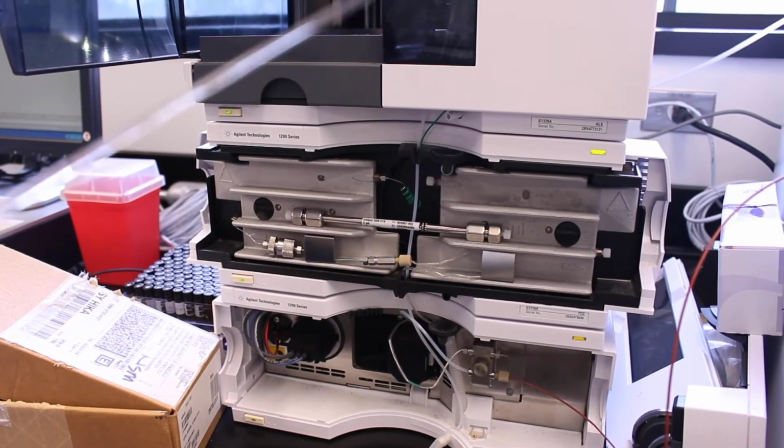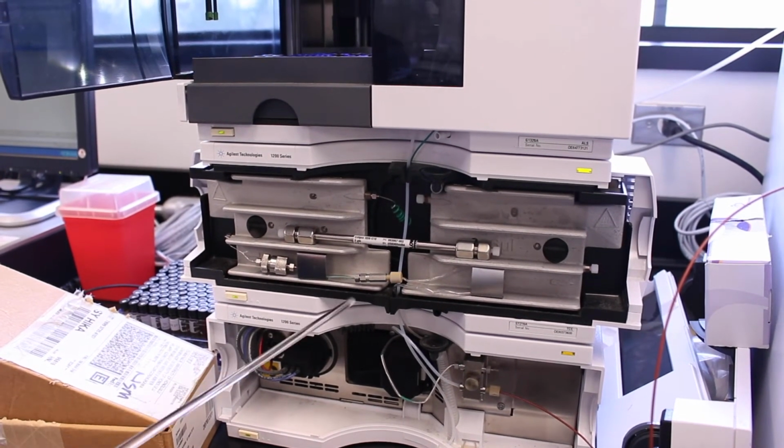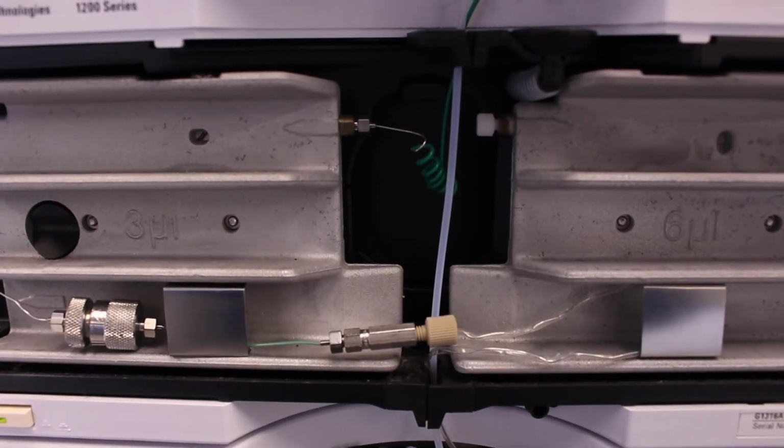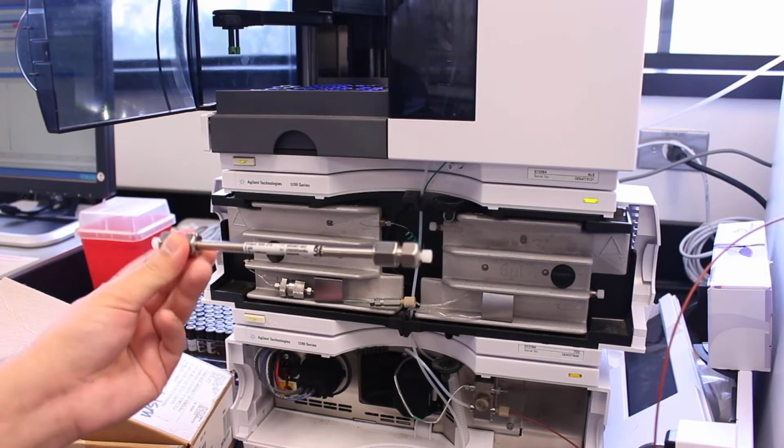Okay, so the mixture is injected. It's being pumped through, and eventually it's going to enter a column. Right now there's no column on the system, it's just the piping. But if there was a column, it would look something like this.